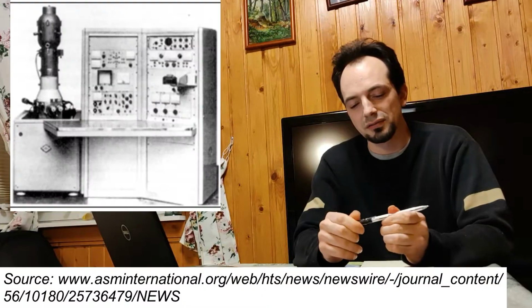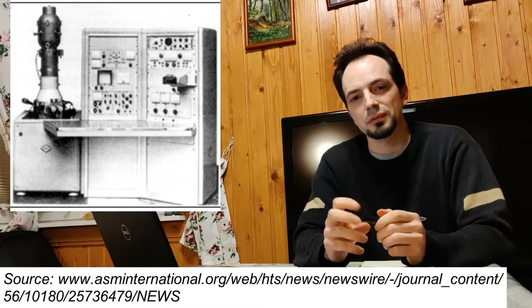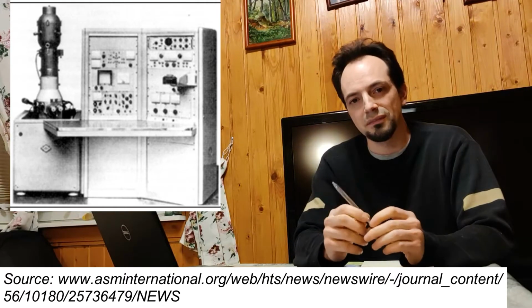Scanning electron microscopes were developed several years after the development of TEM, in the range of the 1930s to 1940s. And commercial SEMs were already sold in the 1960s. And since then they have been developed and upgraded, different add-ons have been added, characteristics have been upgraded, and so on. So modern SEMs are quite advanced devices which give the opportunity of obtaining images of very high quality and very high resolution, in the order of nanometers or even less.